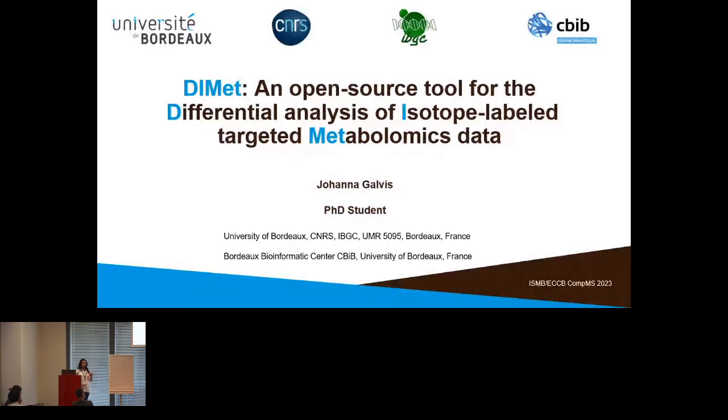In the data set, there is also another metric, the mean enrichment, which is a weighted mean of the isotopologue abundances. In the differential analysis of this labeling part, we have a statistically significant decrease in the labeling.